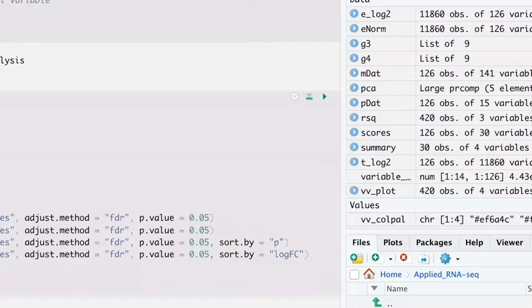So some people don't like using this prior probability and updating the model that you're going to be building. Some people prefer it. So again, Limma does say in its manual that you should be applying this. And so that's what we're going to do.